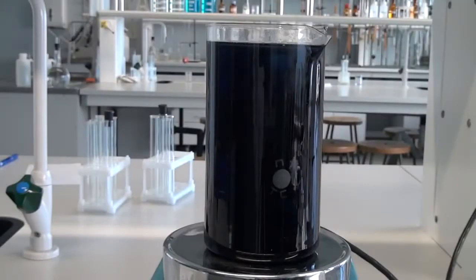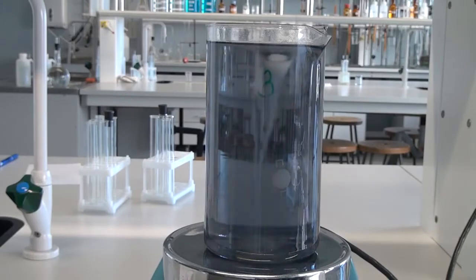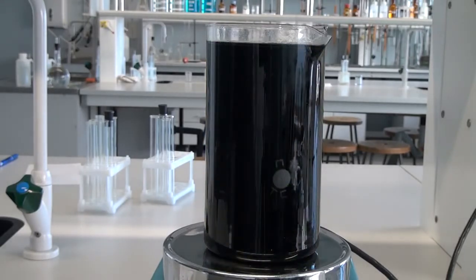Hello everyone! Today we are going to conduct a very interesting experiment called a chemical pendulum, or a Briggs-Rauscher reaction.